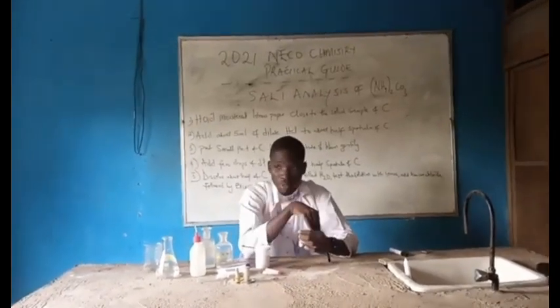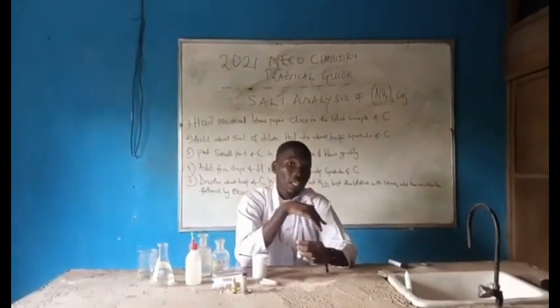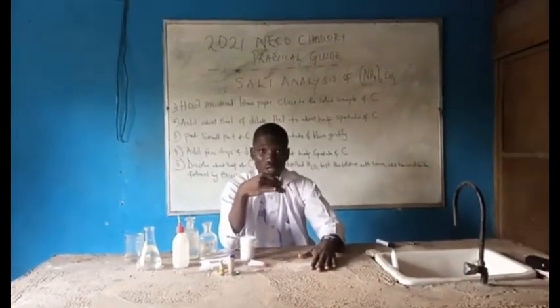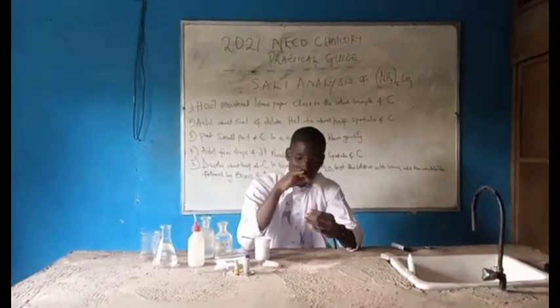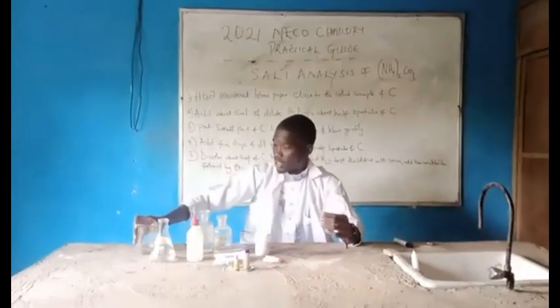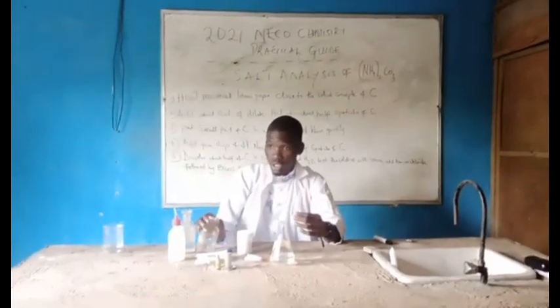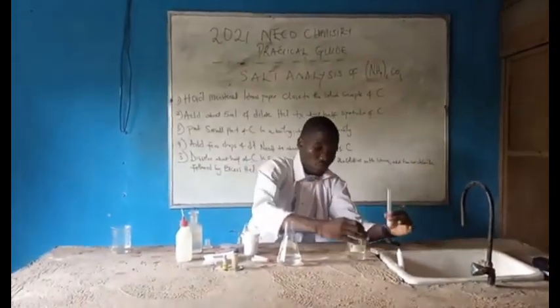So if we are to warm this, and again before we go to another one, when you warm it, it's still going to give you our ammonium ion. So now our sample C plus dilute HCl. Are you with me now? Sorry, this is the conc HCl, and here we have our dilute sodium hydroxide. Here we have our dilute HCl.